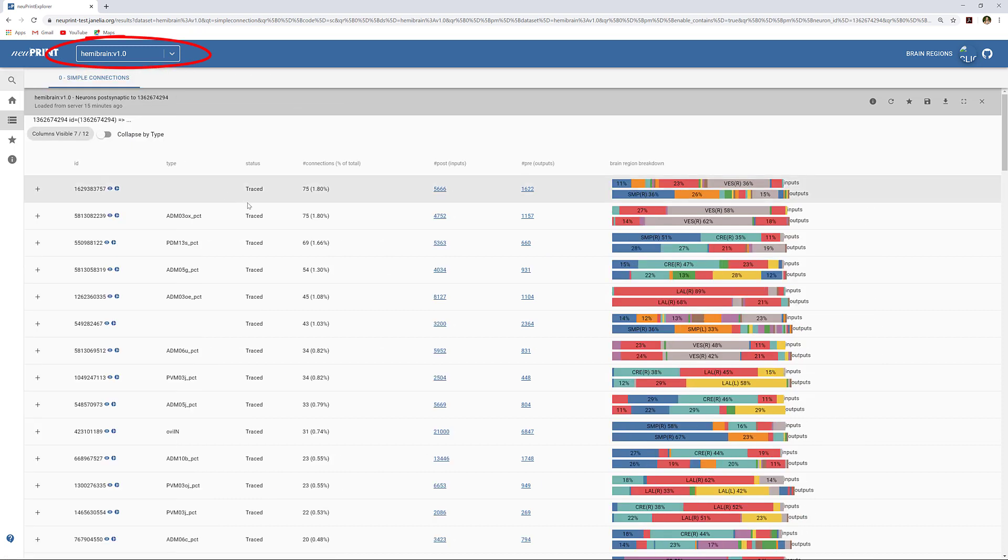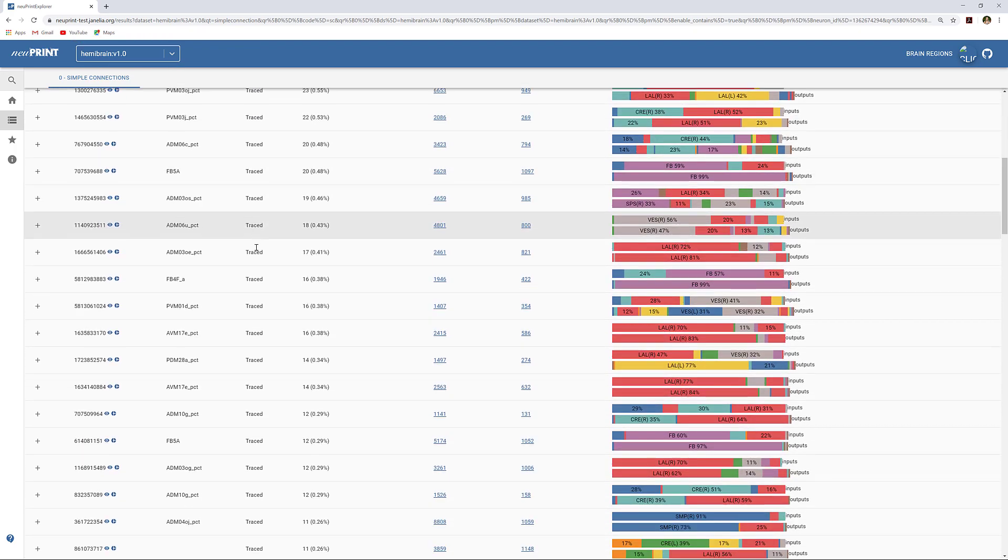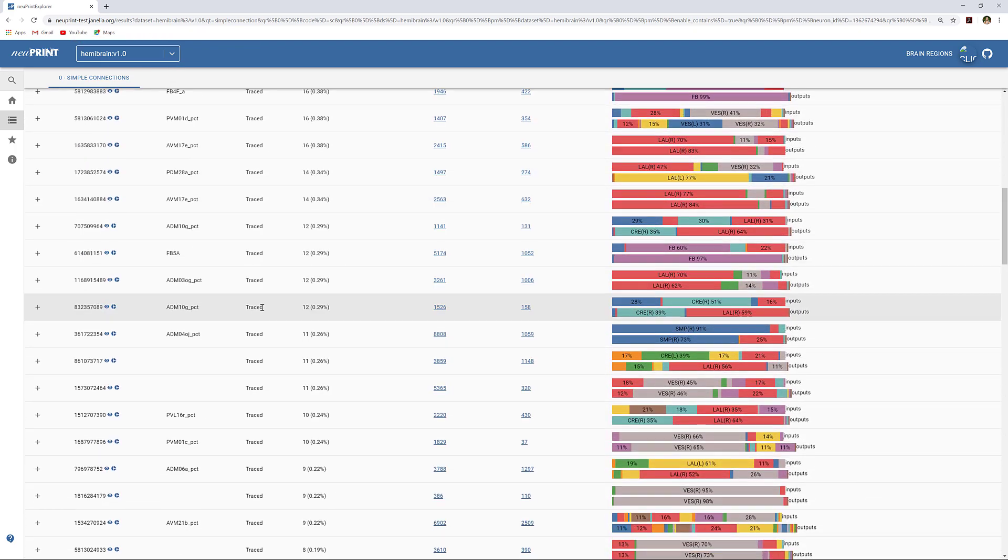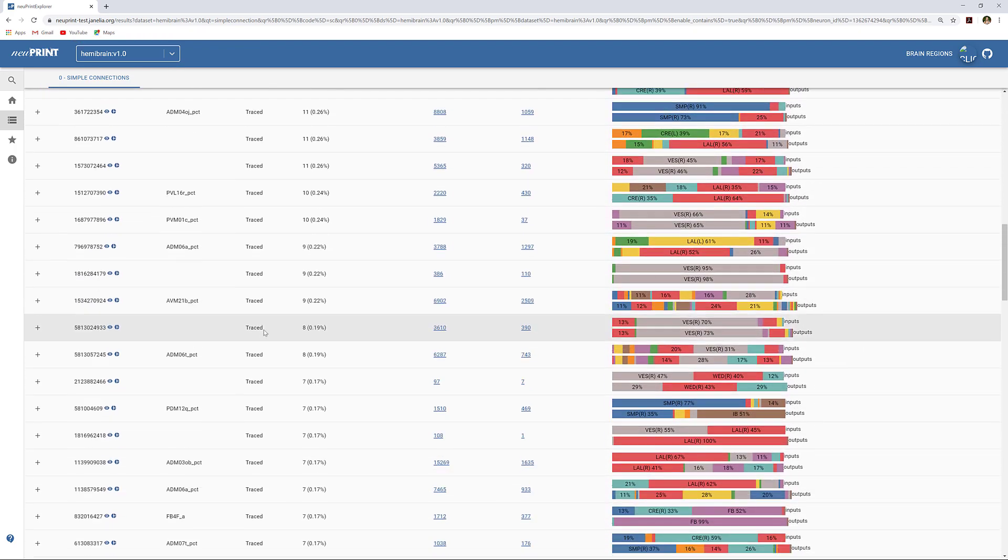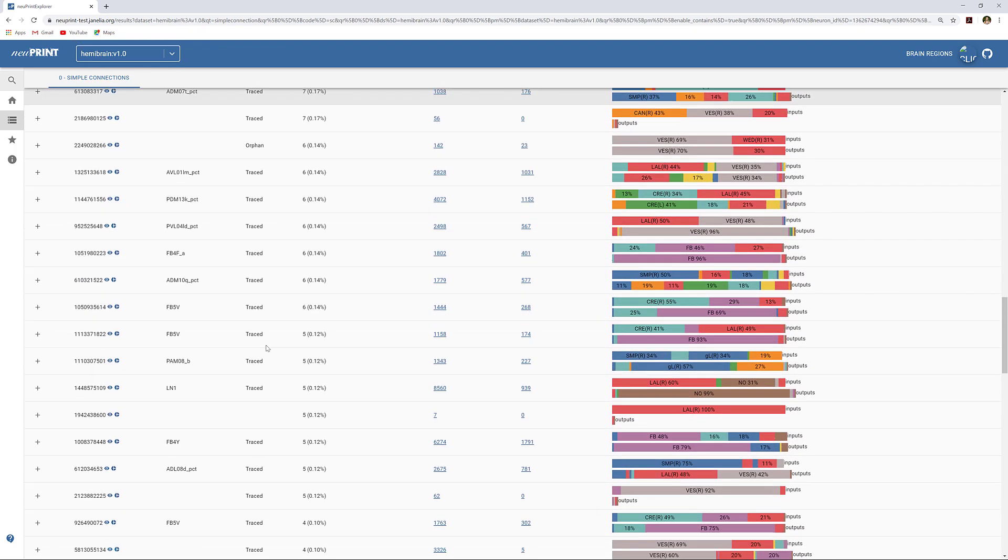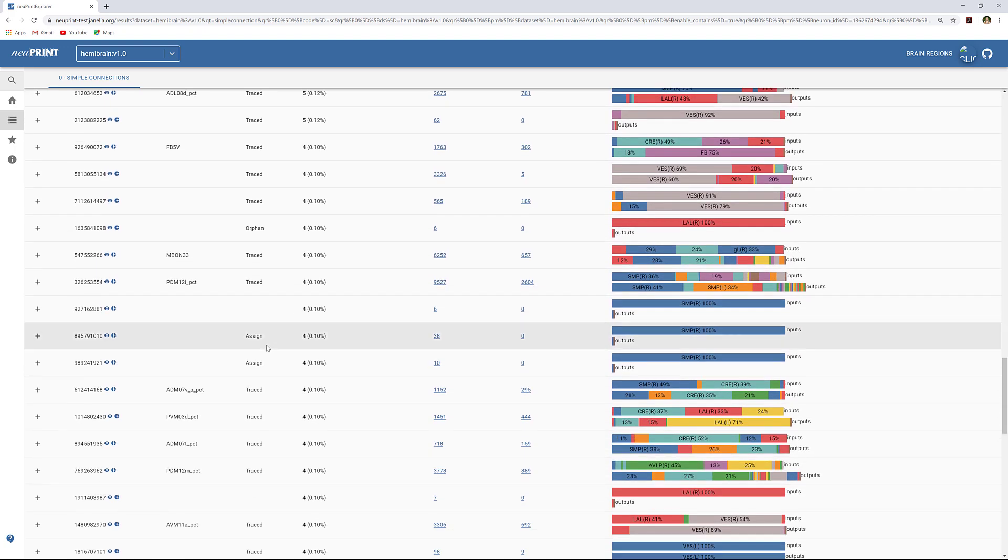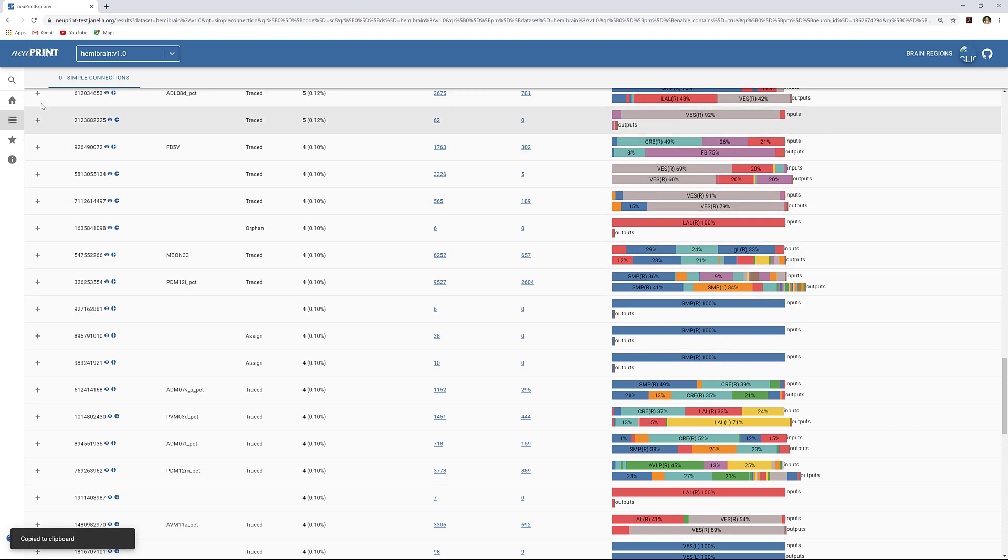Say you are studying the connections to a neuron you are interested in, and you find a small, unnamed body with the status Assign. This status indicates that the body may not have been proofread and you want to see if it's part of another, larger body.